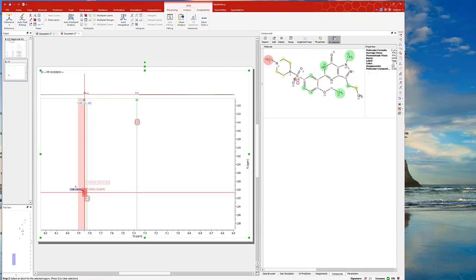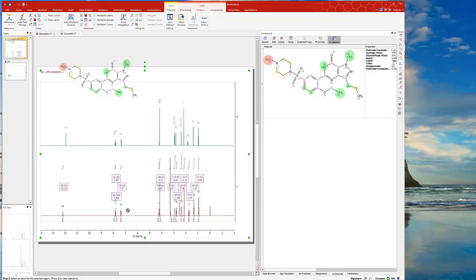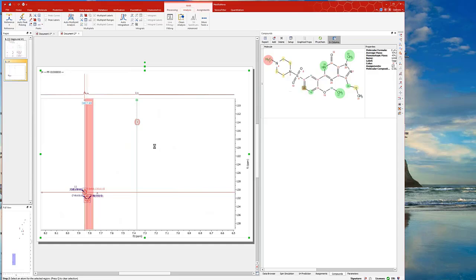Right, so let's go to the structure of the compound here. That's 11, right? So it should be there. So we get the proton and carbon assigned. And so it's here, we just click on it, and it should go to the, let me check, 16, right? So let's put on the 16 here. Right, so 16 and 16. And so it's here, 15. Yeah, you can carry on.